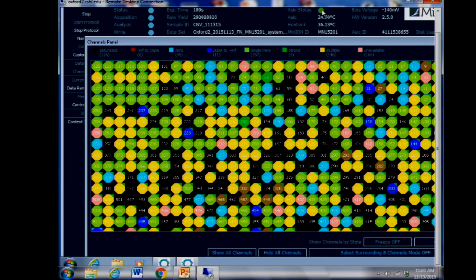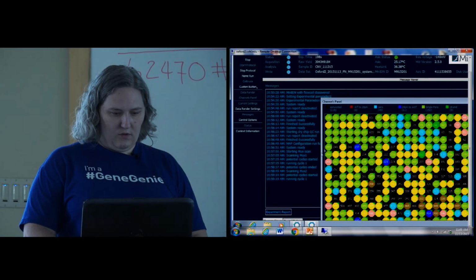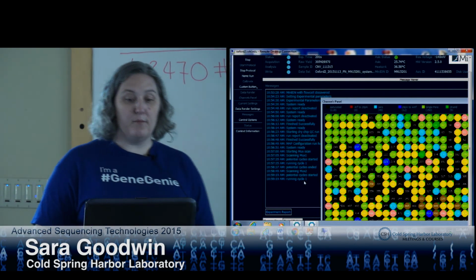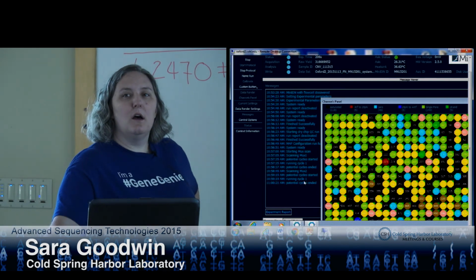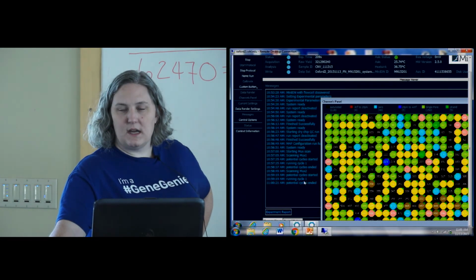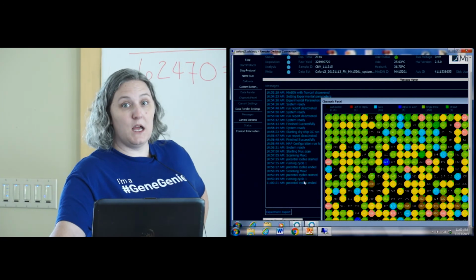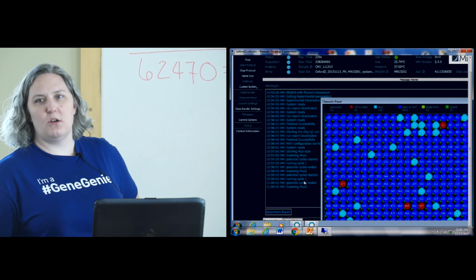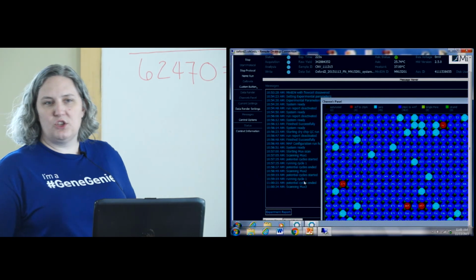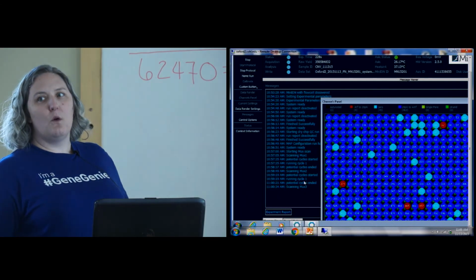Alrighty. So what you guys are seeing right now is real-time nanopore sequencing. Right now, it has gone through 2 cycles of MUX. What MUX means is the selection of active groups. As we discussed, in each channel there are 4 proteins that it can collect data from at a given time. It's going through each channel, each pore, and deciding, is this a good pore? It's passing voltage through it, measuring characteristics of what it thinks is a good pore, and deciding which group it belongs in.